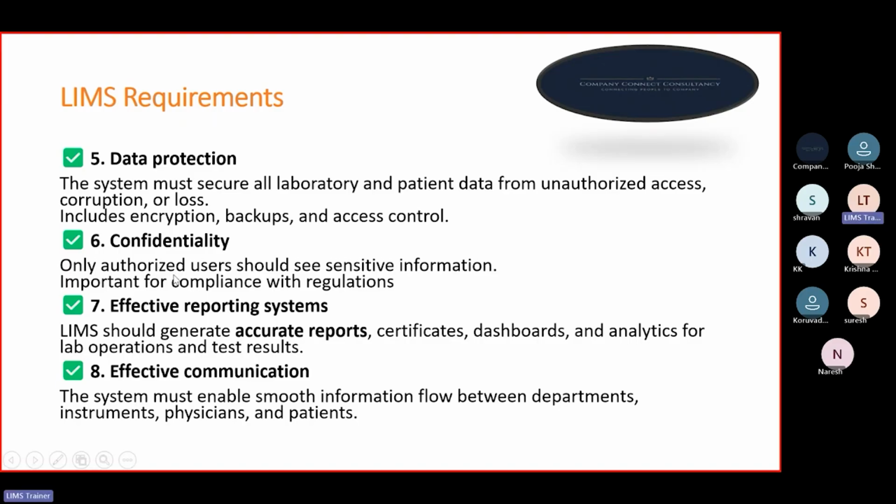Effective reporting systems. LIMS should generate accurate reports, certificates, dashboards, and analytics for lab operations and test results. So an effective reporting system is provided by the LIMS software as well, so there will be no manual work. This is the best automated workflow which we are going to follow in the LIMS software.